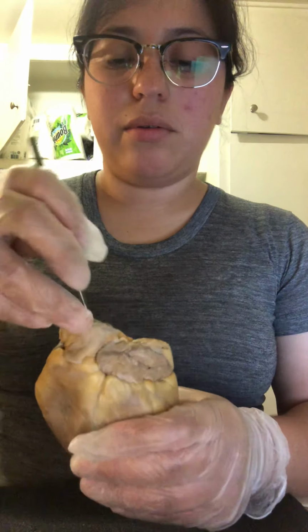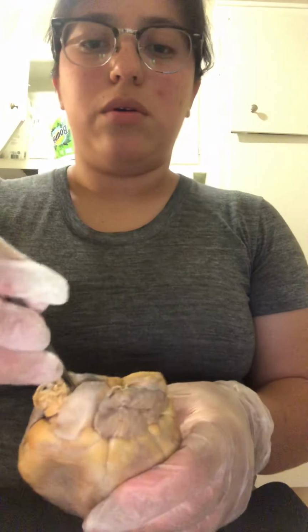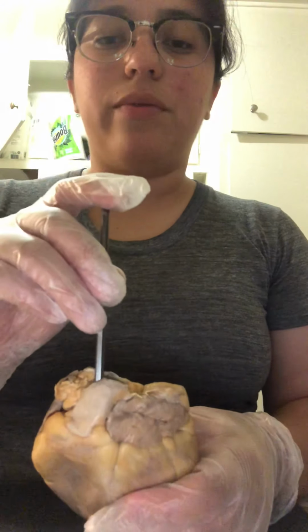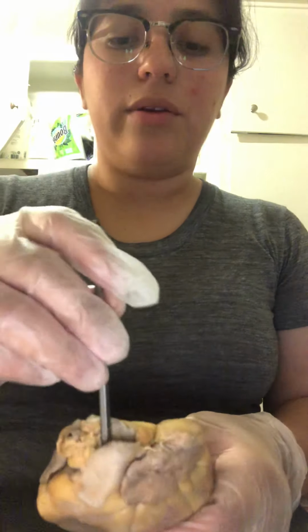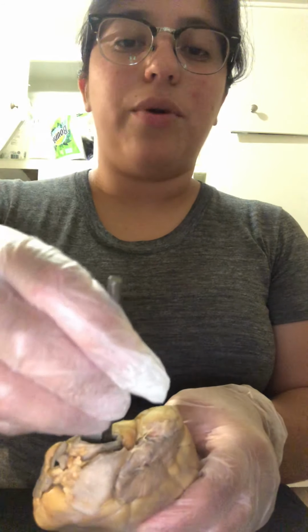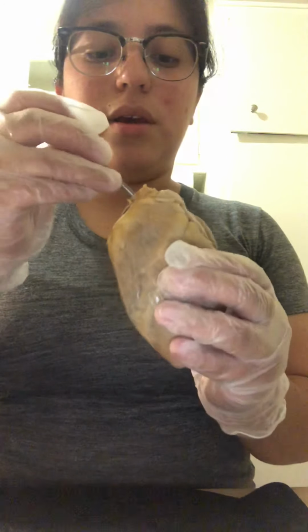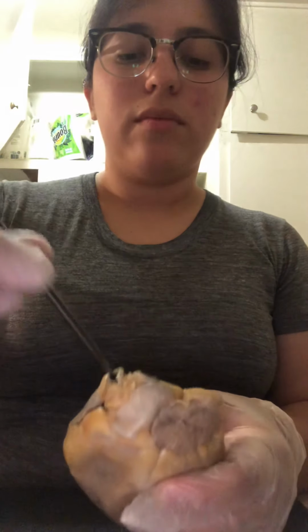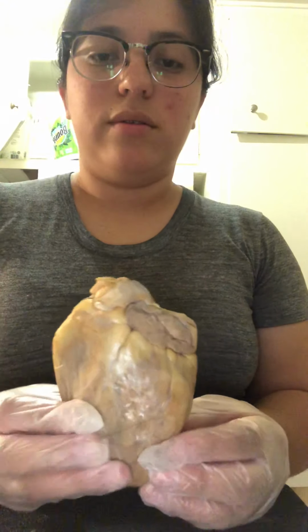Right about here we have the superior vena cava. Superior vena cava, right about here. This would be the aorta. And this right here would be the ligamentum arteriosum. Sorry for my pronunciation. All right. So that's the external dissection. So I'm gonna go ahead and cut it.